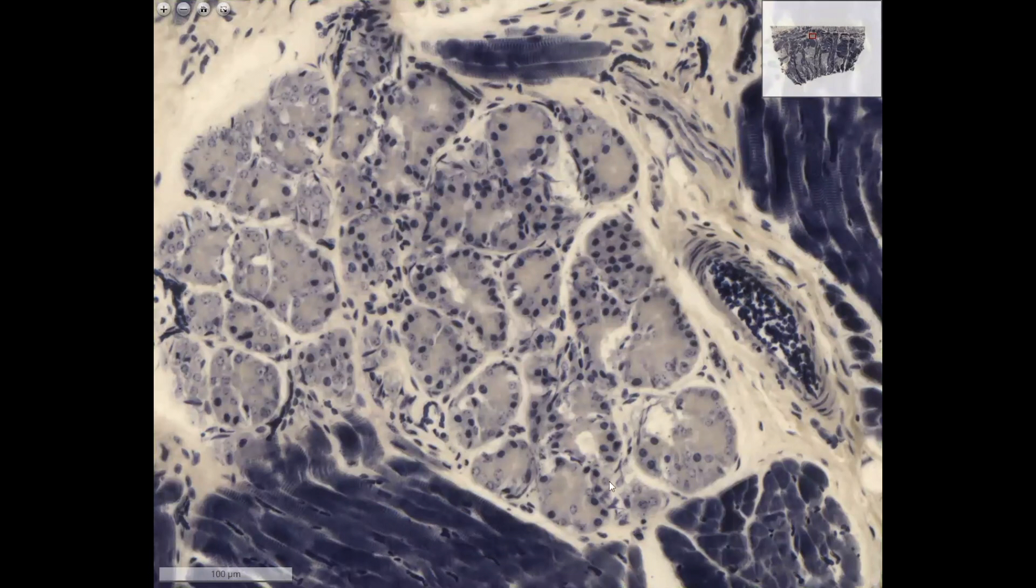Cross-sections of the salivary glands. And here you see an artery in an oblique cut with the red blood cells. The red blood cells are black with this staining.